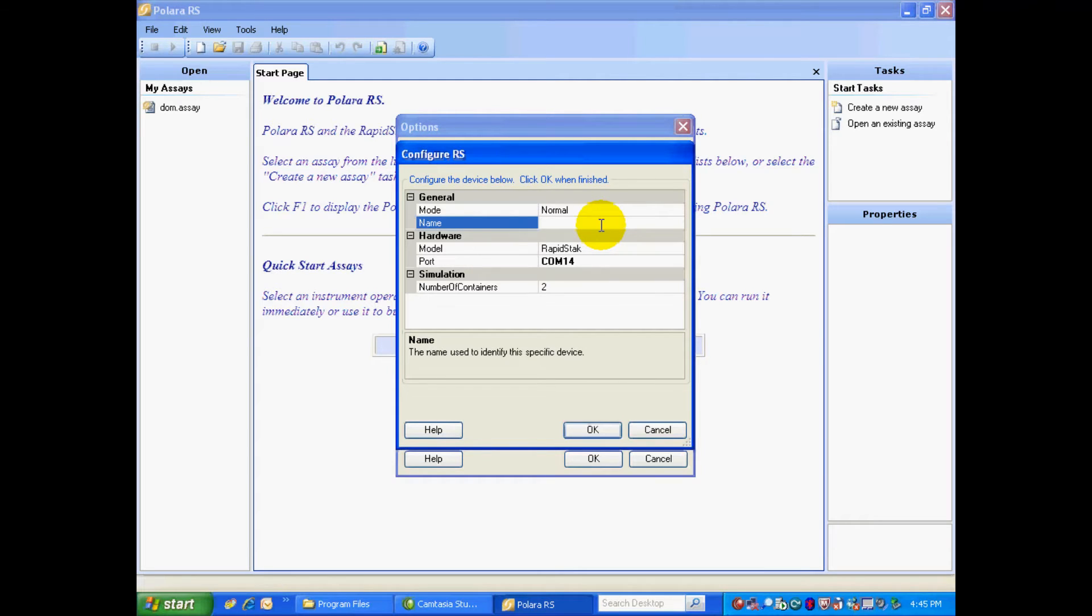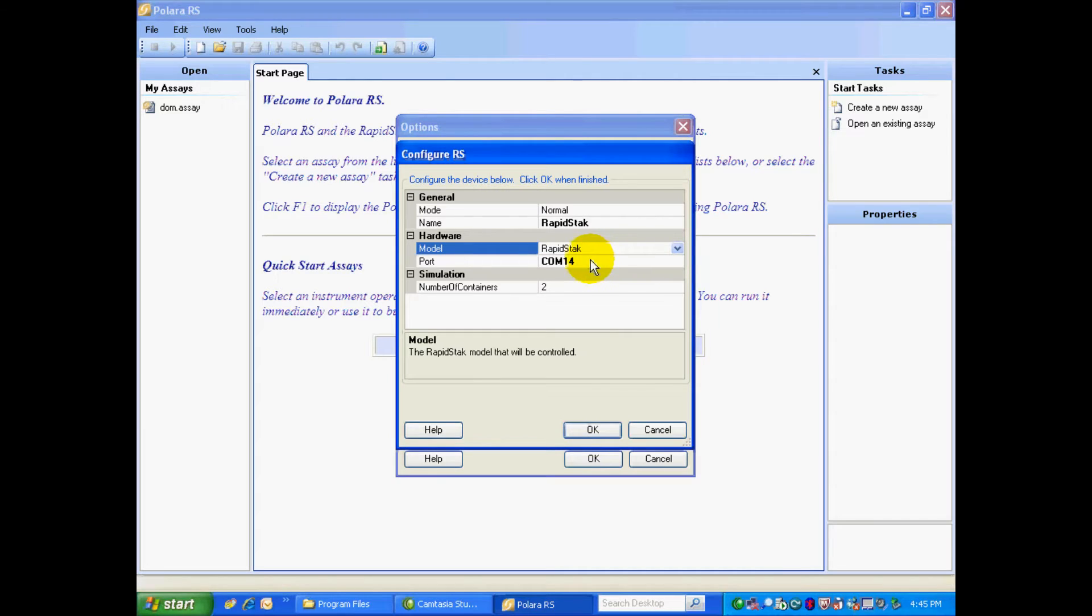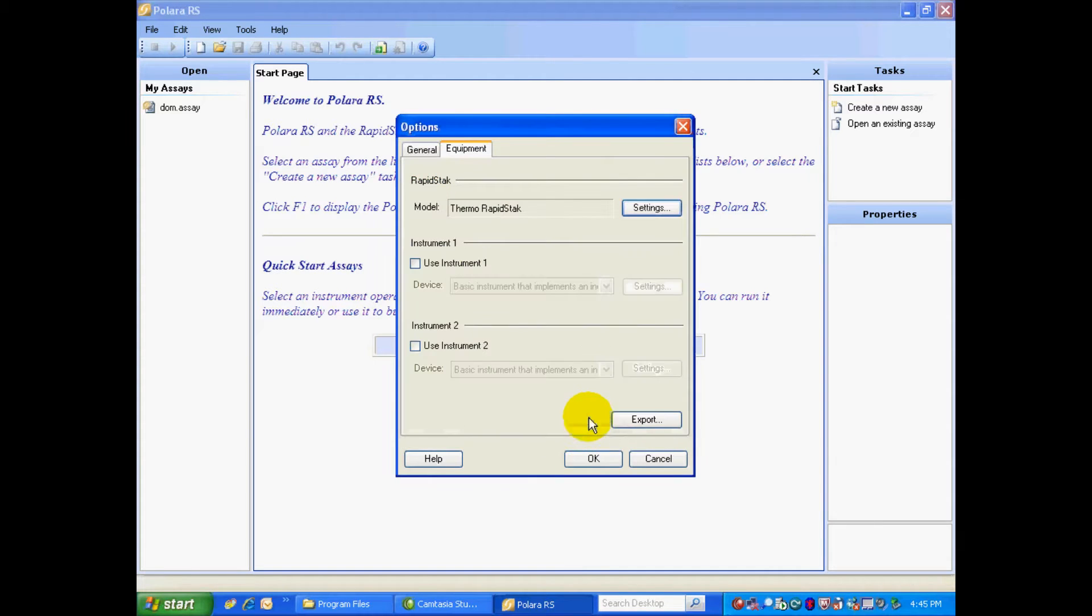You have to give the instrument a name. So I'll give the Rapid Stack the name Rapid Stack. It's a standard Rapid Stack, not a 2X. And my Rapid Stack is on COM 14, which I know is correct. So we select OK.